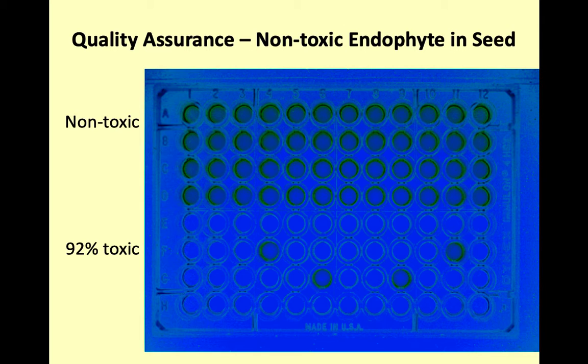We have seen values almost 100 times that high in pasture samples that have been tested, not here in Kentucky, but another state. To give you an idea of the sensitivity of this test, 400 parts per billion is when you start seeing toxicity. That clear color occurs at 25 parts per billion.